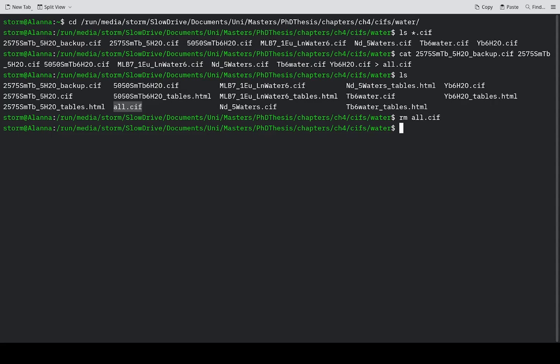But some people do not care. And in that case, everything is a bit easier. You would just do cat *.cif to select all CIF files in this folder.